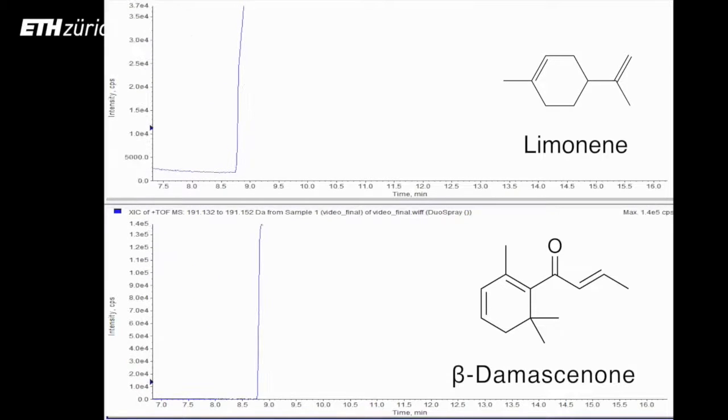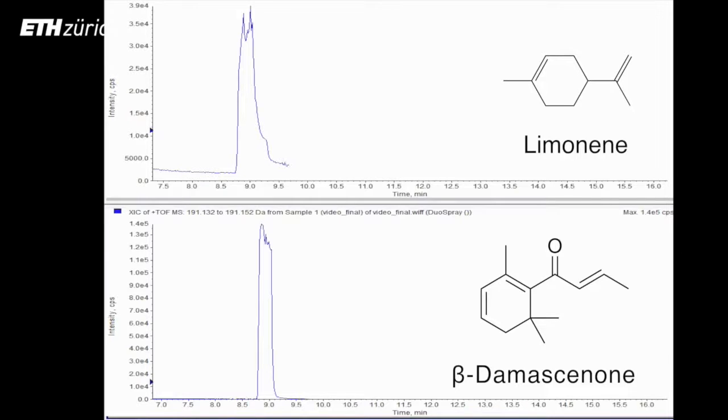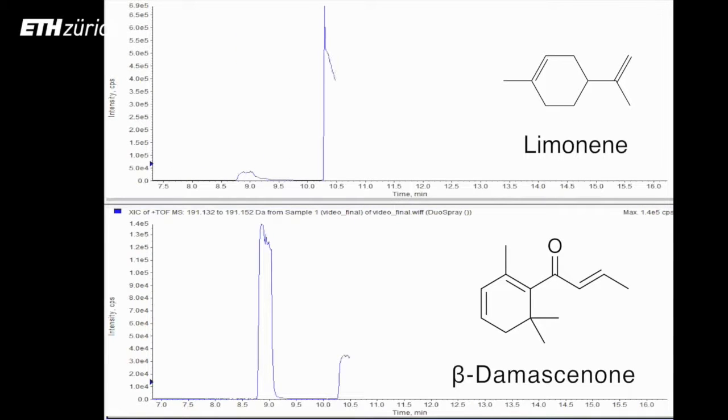To demonstrate the capabilities of our mass spec, we would like to show a simple analysis to you, where our instrument is used to recognize volatile organic compounds from different sources. My colleague Nora has drunk either apple or orange juice and we would like to know what she drank. Therefore, we made calibration measurements to identify juice-specific compounds. As we can see, time traces from two substances are shown. Two breath exhalations were recorded, one from a subject that consumed orange and another from one who drank apple juice.